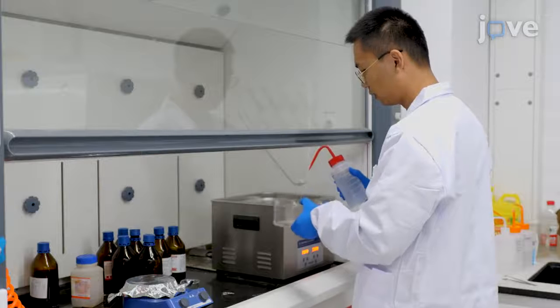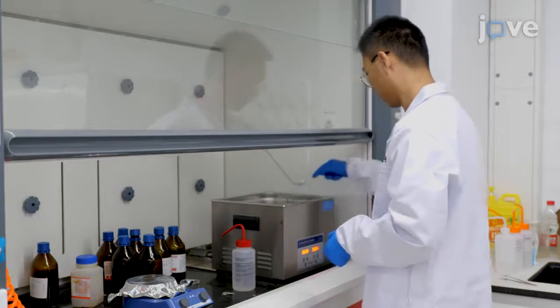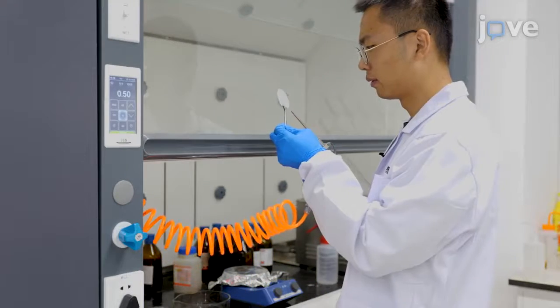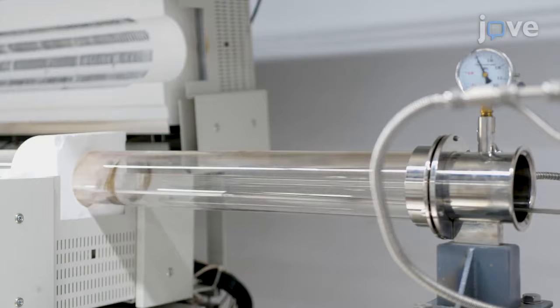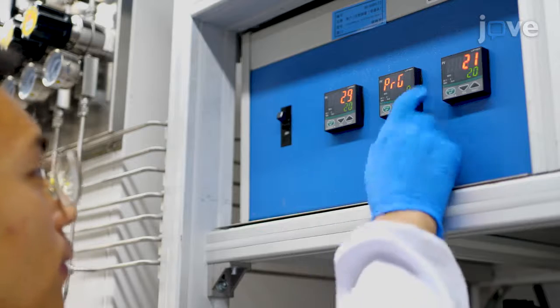To begin, rinse the NPSS with acetone, ethanol, and deionized water 3 times, and dry the NPSS with a nitrogen gun. Load the NPSS into a 3-zone high-temperature furnace with a long, flat temperature zone, and heat the furnace to 1050 degrees Celsius.